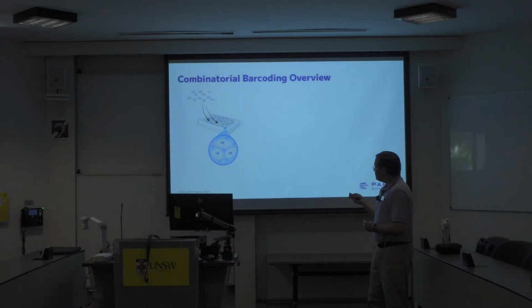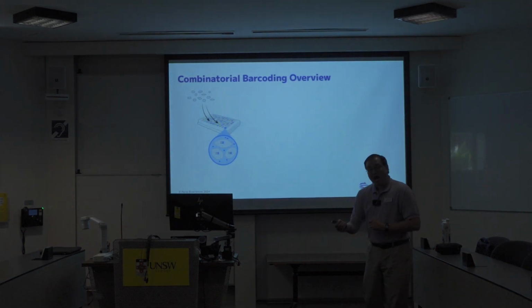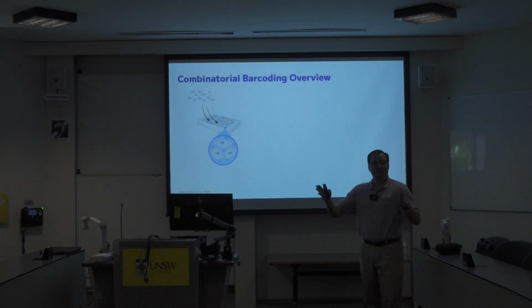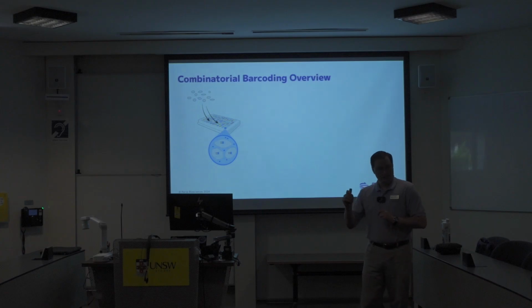So we're going to reverse transcribe the mRNA using both an oligo DT primer to get 3' information and random hexamers. And these hexamers allow you to get information throughout the transcript, not just on the 3' end. So you get SNPs, you get splice variants, you get more information as opposed to just 3' oligo DT information.